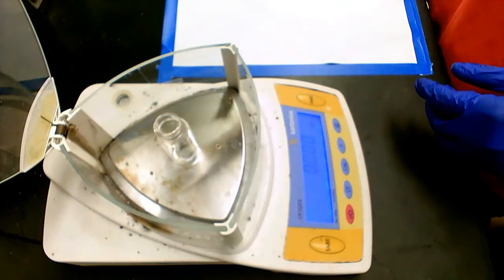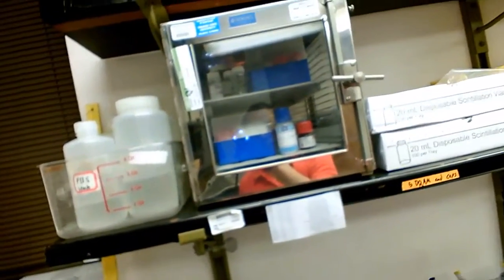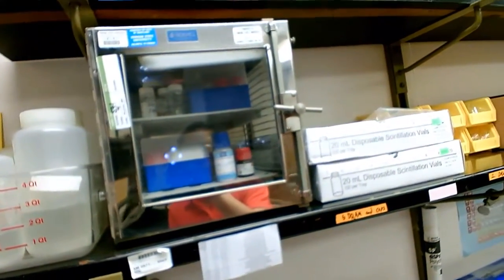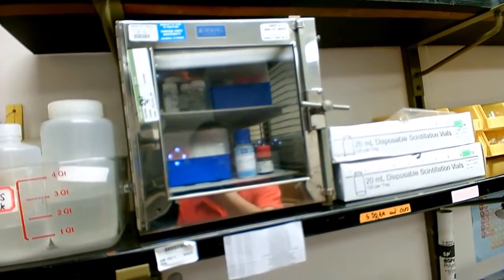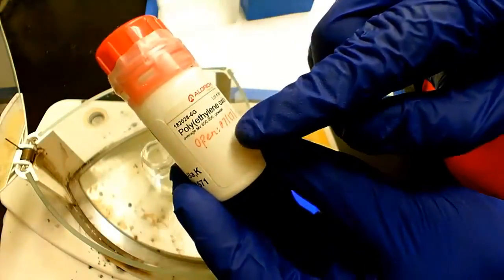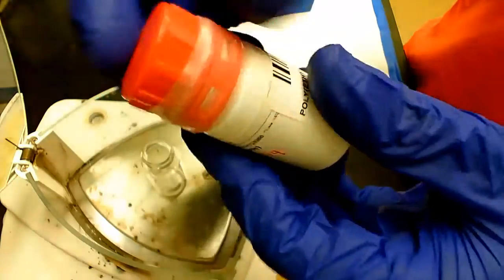All our polymers are stored in a desiccator on the shelf just above the balance, and you want to grab the polymer you need. For this demonstration, I'm going to show you how to make a 600K PEO solution. So this is the polymer we need. As you can see, 600,000 polyethylene oxide.